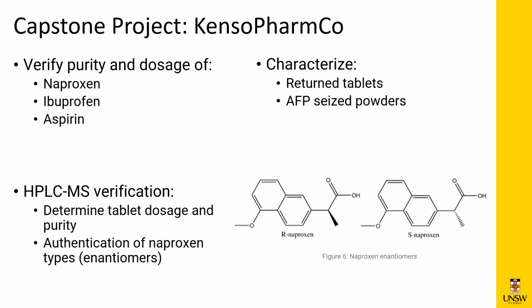In attempting to assist with the investigation, the HPLC-MS team aims to address the challenge of verifying the purity and dosage of the authentic pills, as well as determine if the naproxen pills are safe for consumption, as naproxen has 2 different versions, or enantiomers for the scientifically inclined.